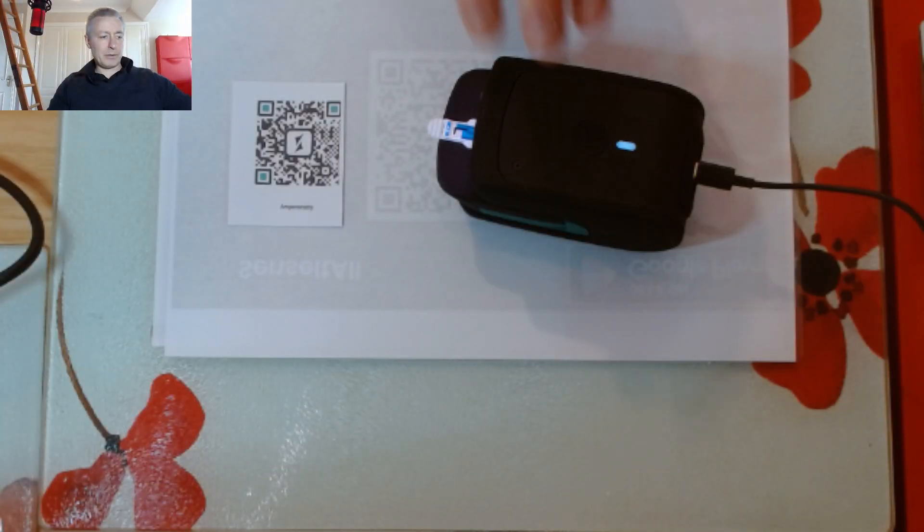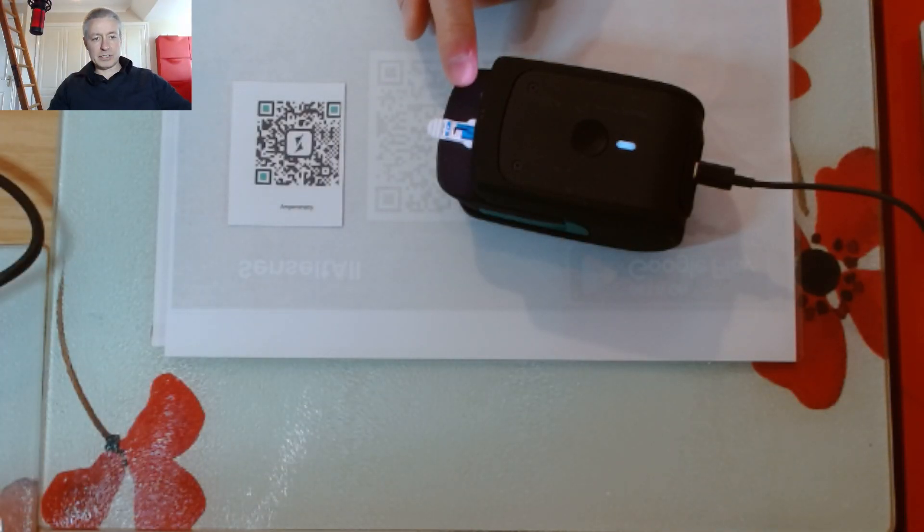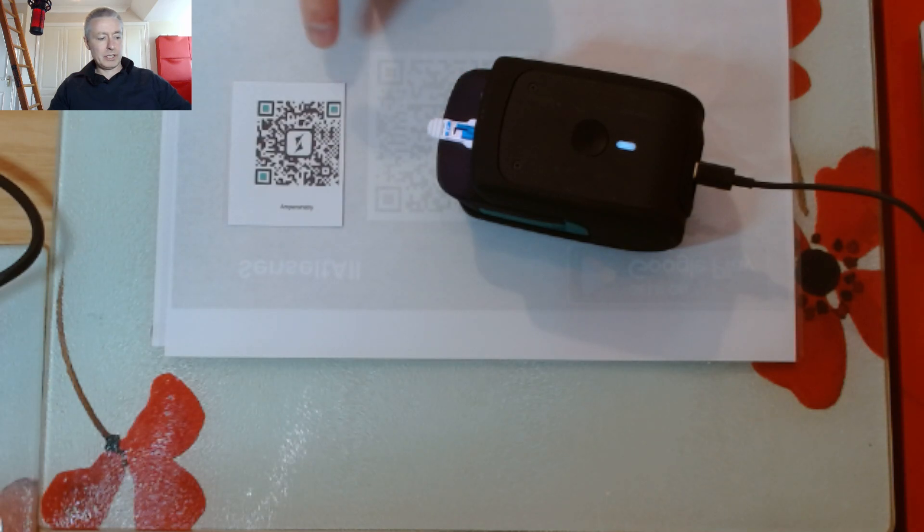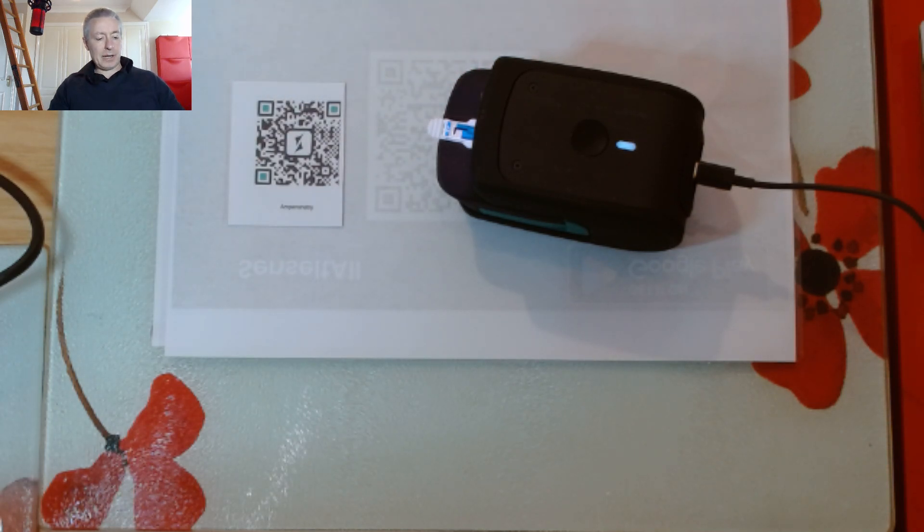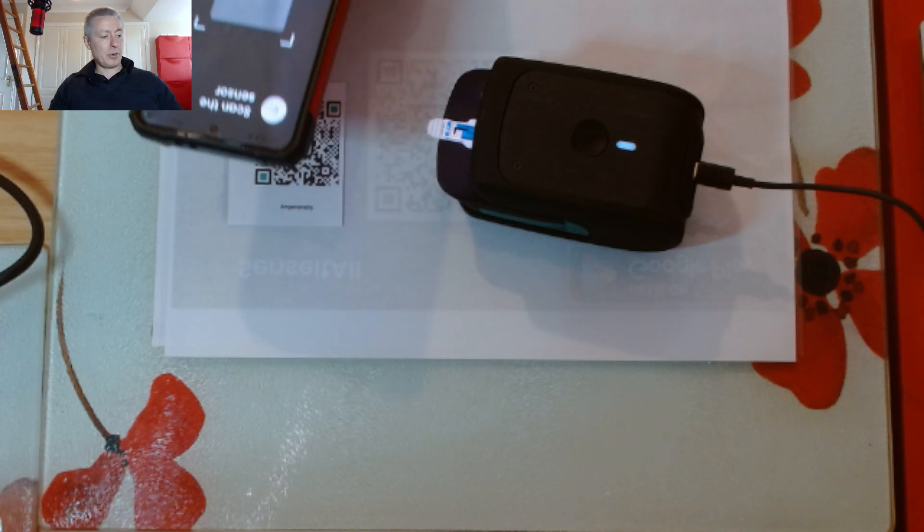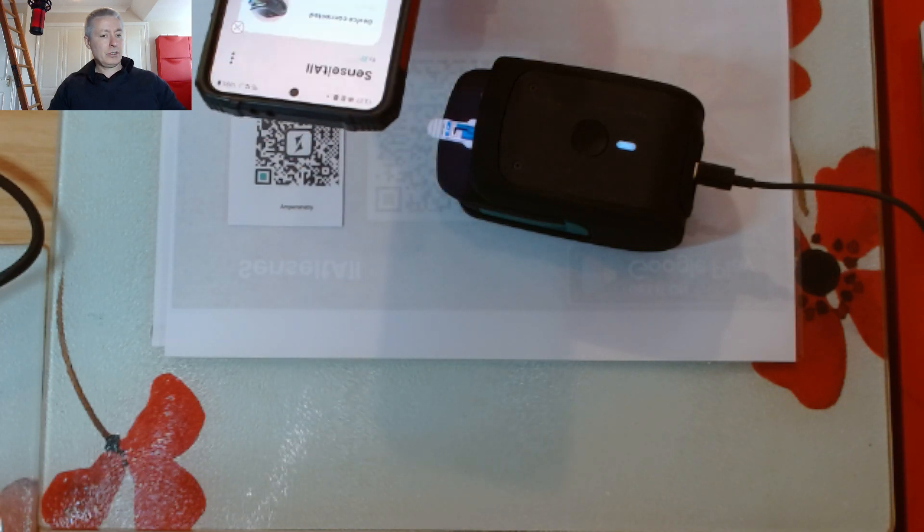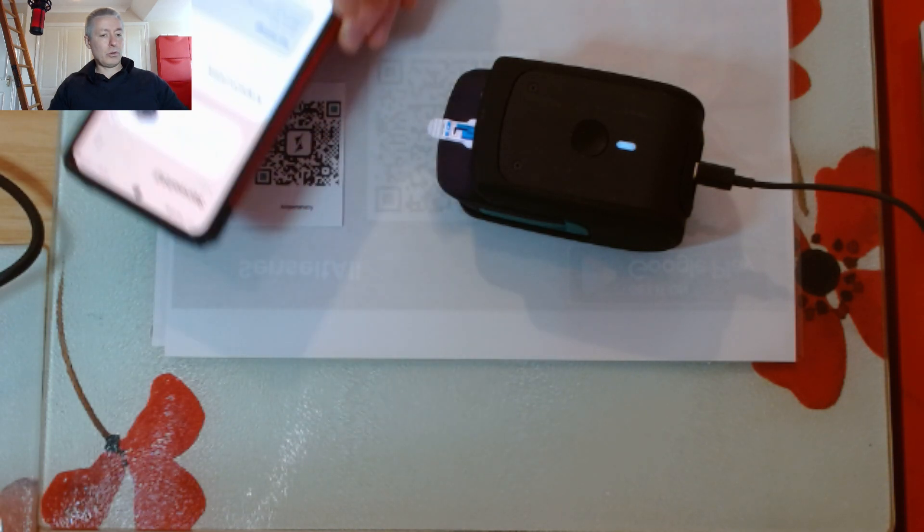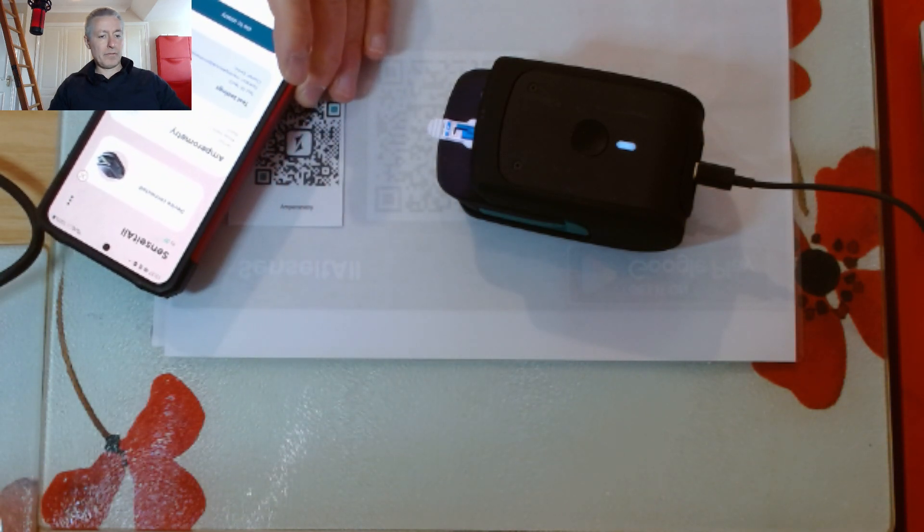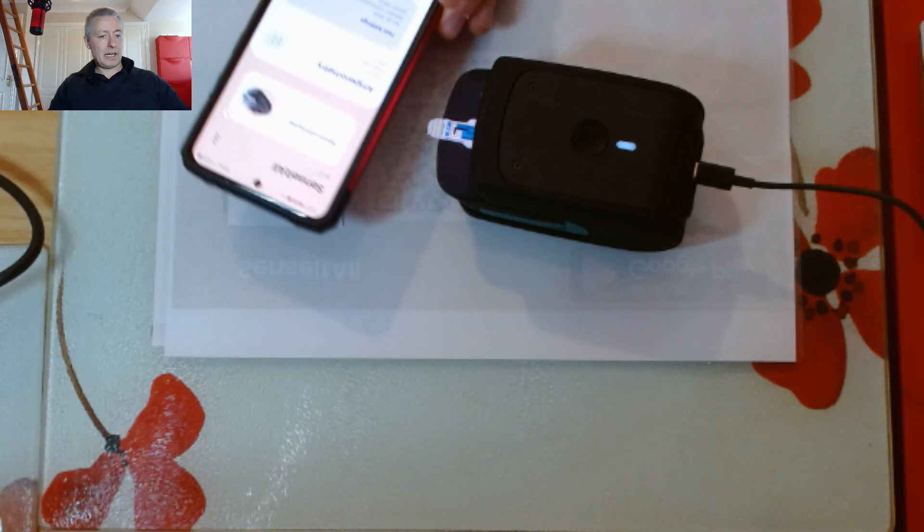Hi, I'm just going to give you a quick demonstration with the Sensit hardware in front of me. I want to show you how to go through different analytical techniques. If you want to do amperometry, you can hold your phone and scan the QR code and it will bring you amperometry.